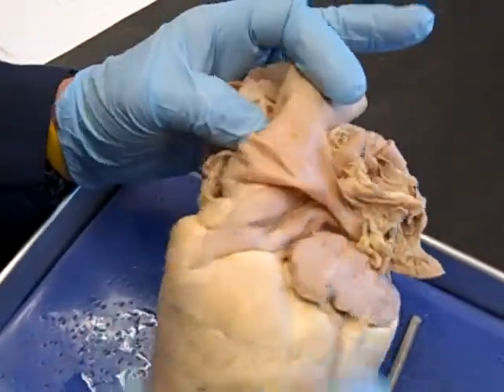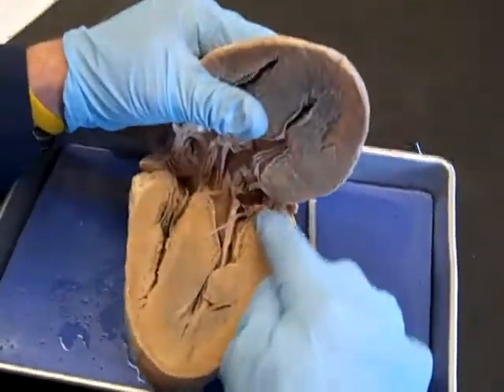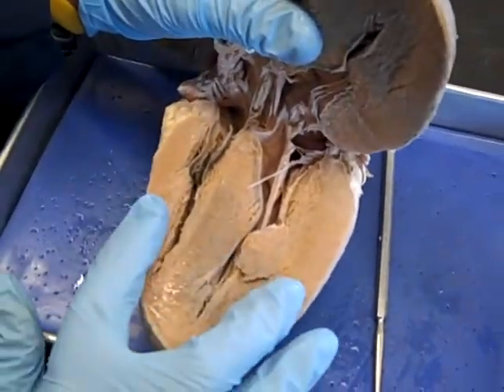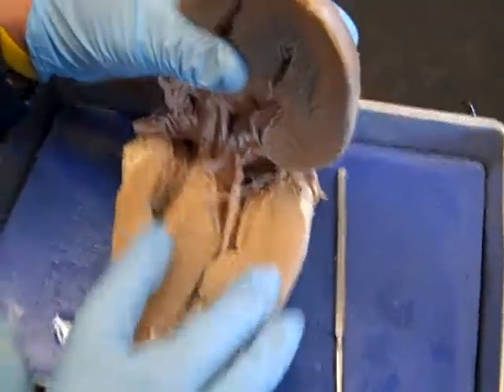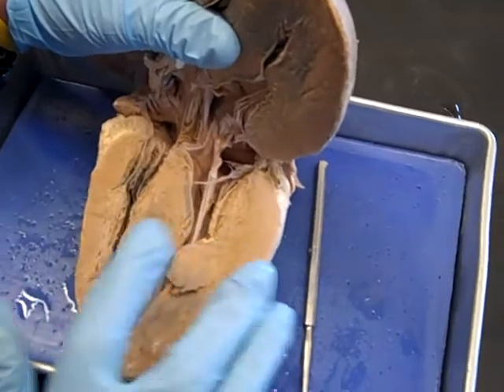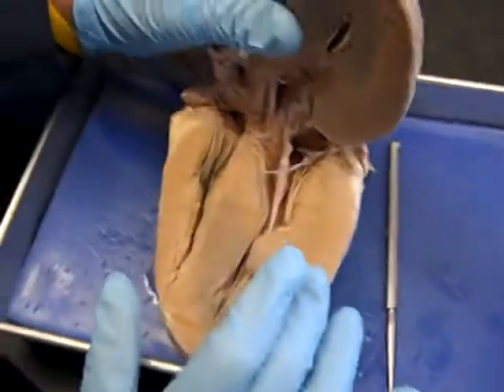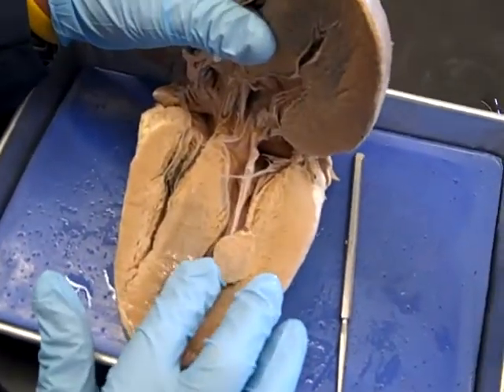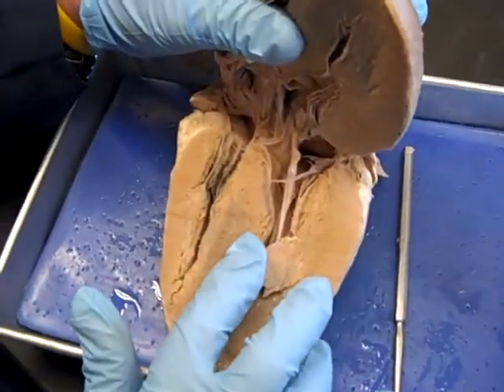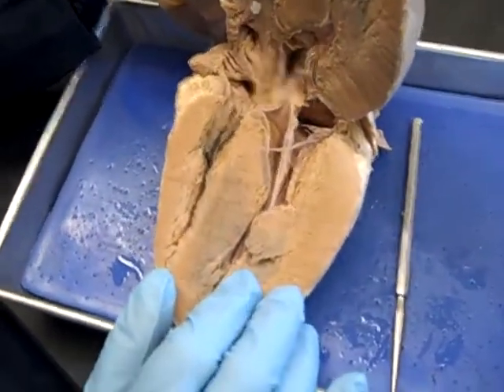We have the pulmonary trunk and the aorta. When we open the heart we can tell the left side because it has a thicker wall, while the right side has a thinner wall. The left side pumps exactly the same volume as the right, but it needs thicker walls because it pumps with more force to distribute blood throughout the body.